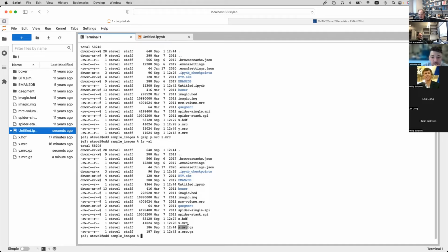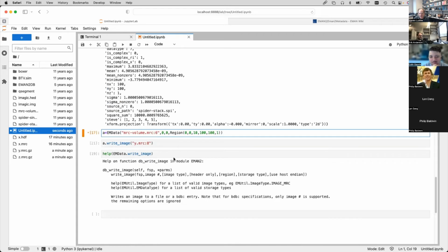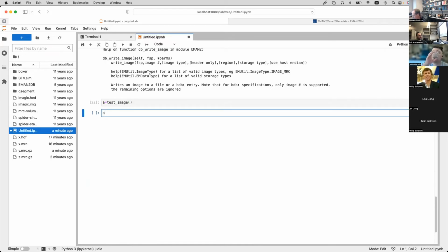My demonstration didn't work. Let me do it on the whole volume. I want to actually do the demonstration. Or let me do it with my noise data. We'll make a test image and do it. That'll work. That's what happens when you do demonstrations on the fly.